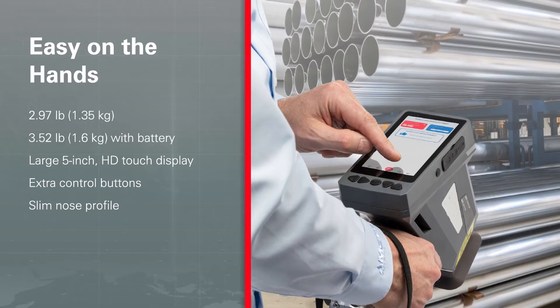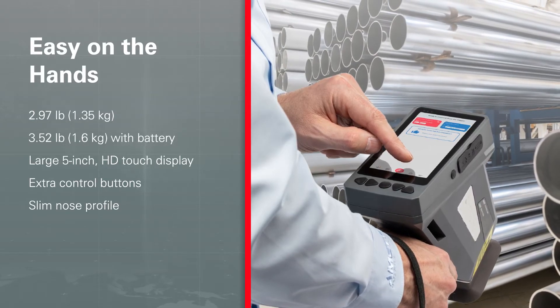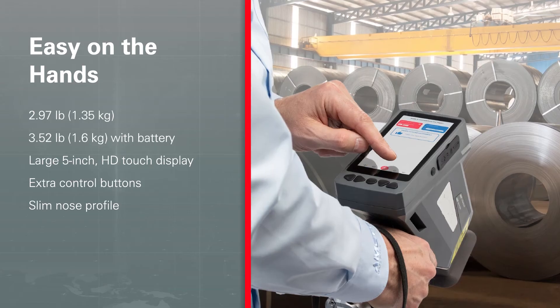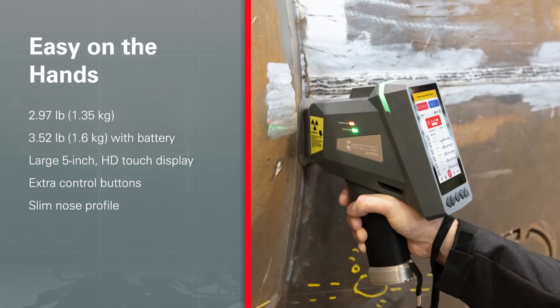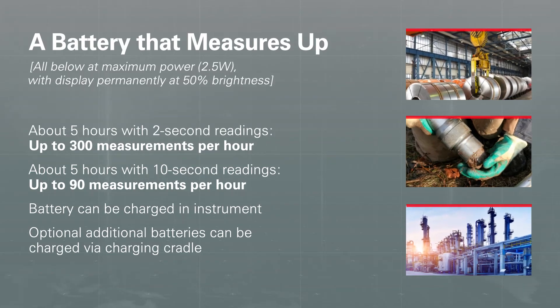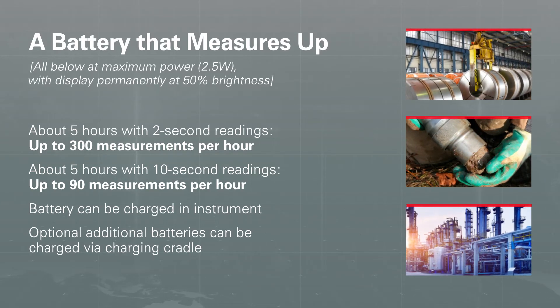Spectro XSort is also easy to use. The latest model is smaller than previous versions — balanced and optimized for one-handed use, even with smaller hands. You get a trigger that's easy to squeeze, a big wide-angle high-definition display that's easy to read, and extra physical buttons that are easy to work even with gloves, plus a smaller probe nose that eases into tight spots. Forget vague claims about long battery life — Spectro gives you hard numbers: how many measurements you might get from a single charge, plus battery options to keep you up and running indefinitely.